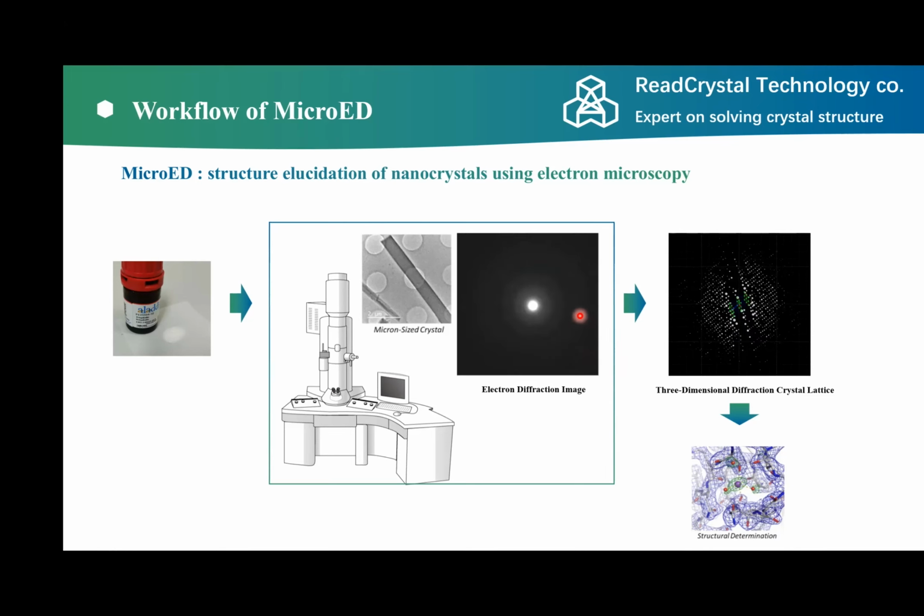Then the next step is to convert the series of diffraction patterns into a three-dimensional diffraction pattern. Then with this three-dimensional diffraction pattern, you can solve the structure directly by using, for example, direct methods.